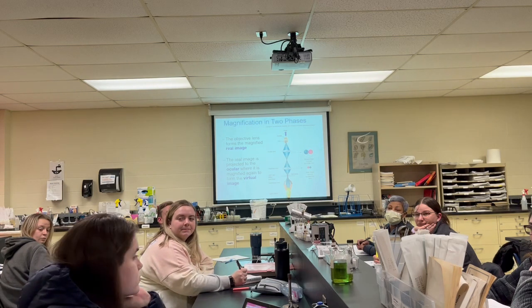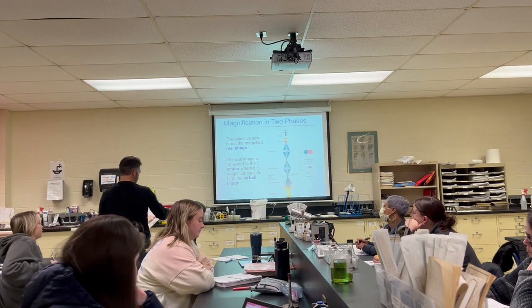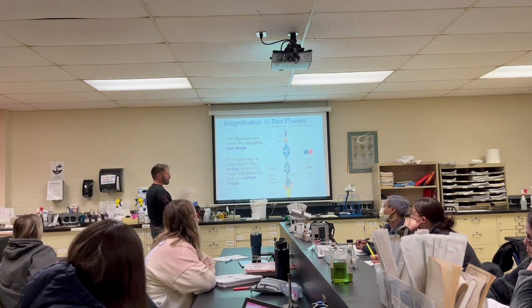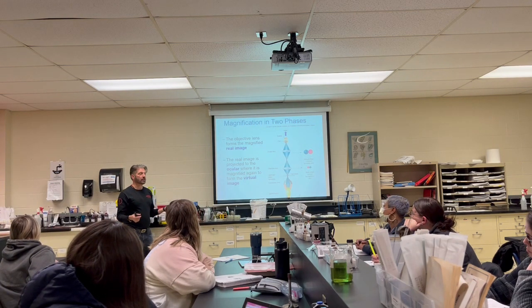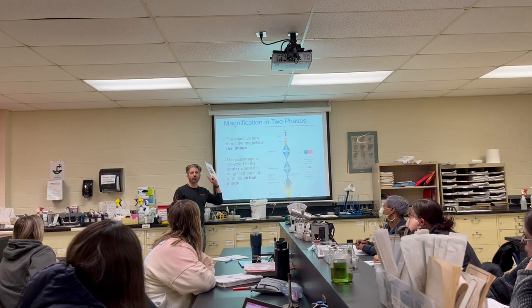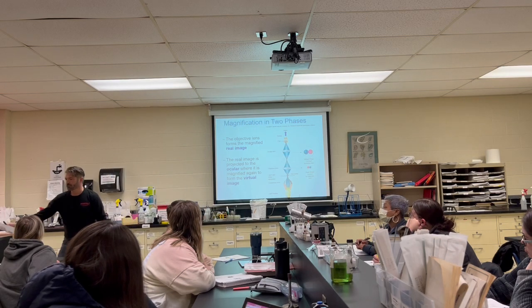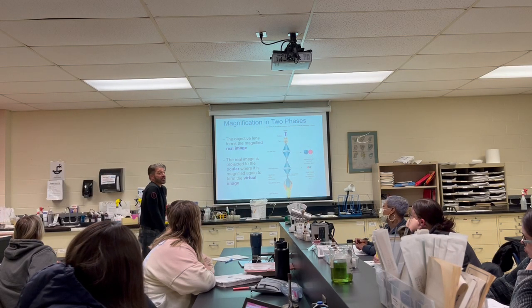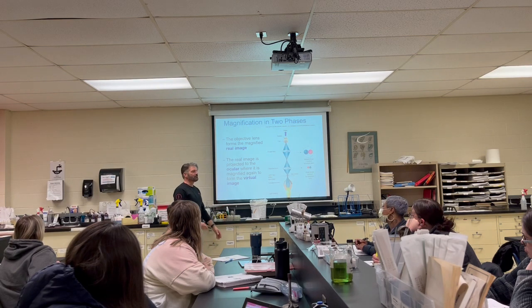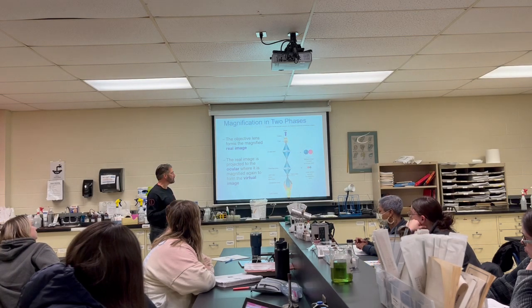I say that because 2 years ago, I went in for my eye exam, and the doctor said, Bill, you have demodex in your eyelashes. I go, what are you talking about? And he showed me a picture. He goes, yeah, those are living in your eyelashes. They itch like crazy, but it was shocking, especially because I'm an optician and I've never heard of it before. So please wipe the oculars off in case there's any critters living in there.